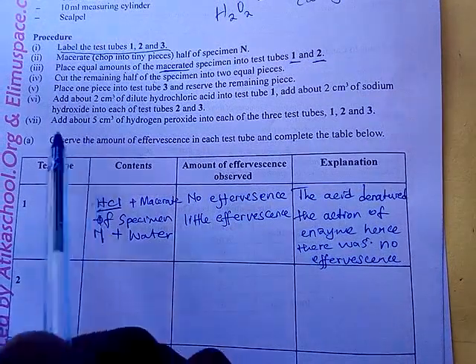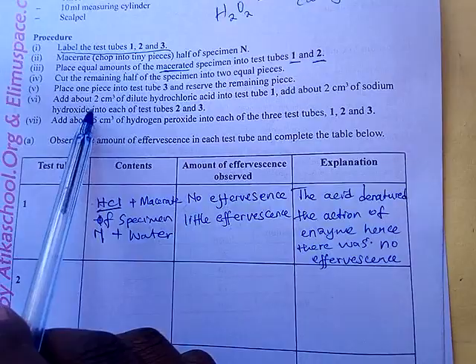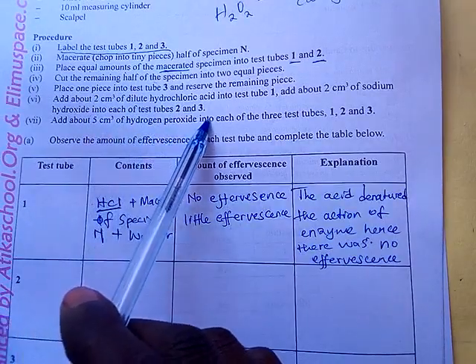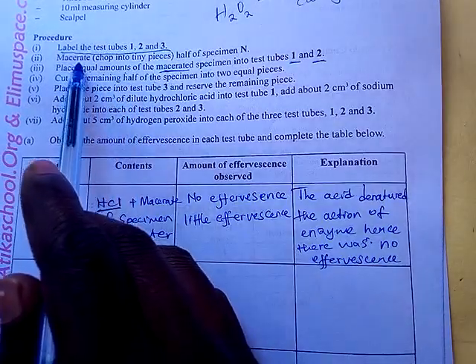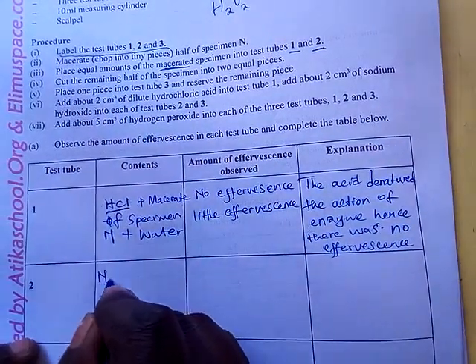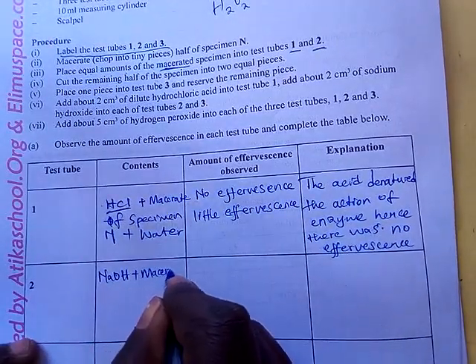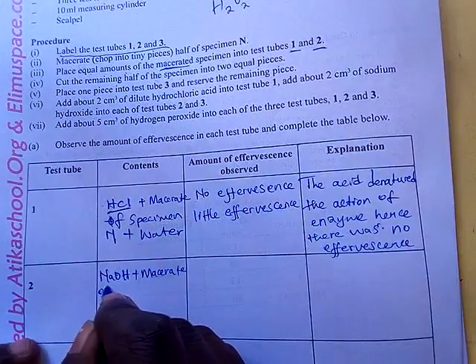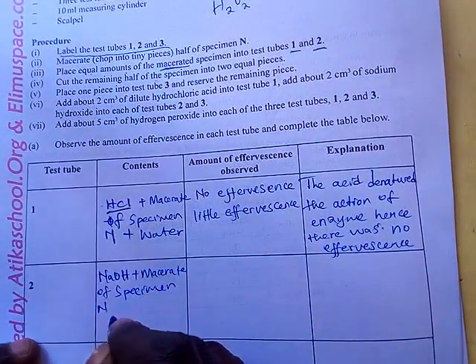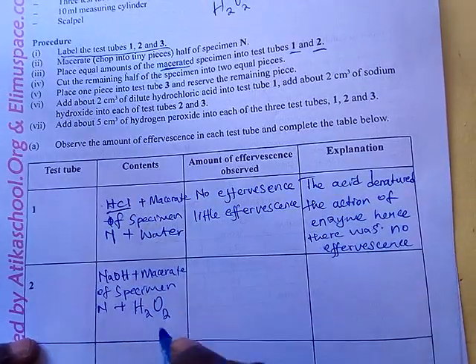The content, you are told, in test tube 2: you add sodium hydroxide and then hydrogen peroxide plus the macerates. Now the content is sodium hydroxide plus macerates of specimen N plus the hydrogen peroxide.